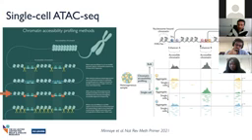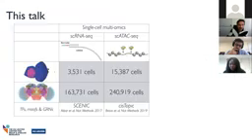and that may then point to regulatory regions such as enhancers and promoters that are used specifically in that cell type. So we applied this technique, single cell ATAC-seq, to the eye development in the fly, as well as to the brain, together with single cell RNA-seq. And in total, this is more than 400,000 cells already. And I will discuss both of these systems here.